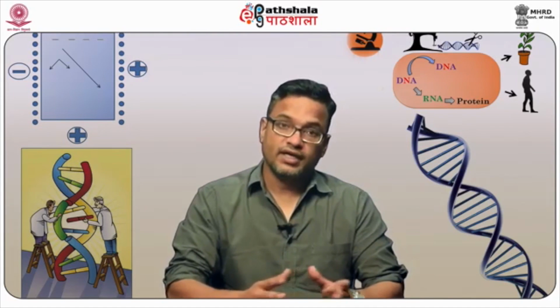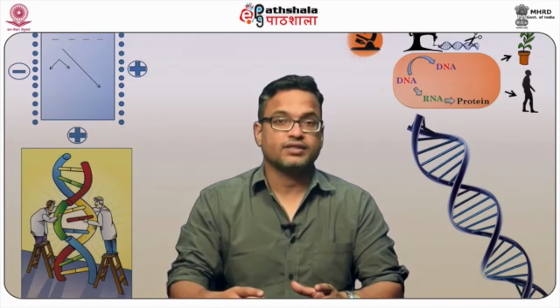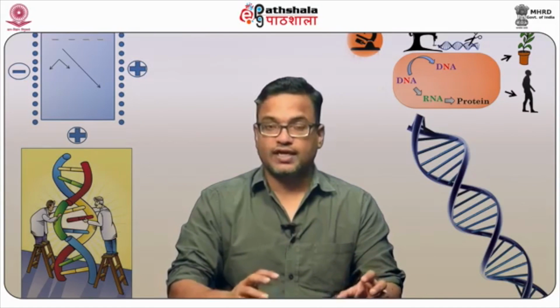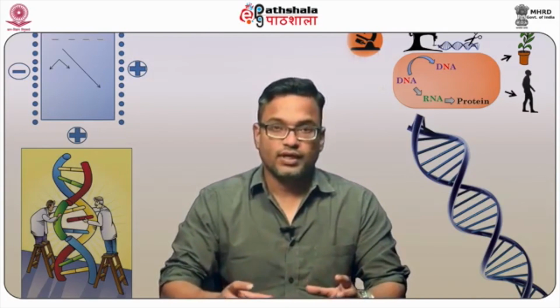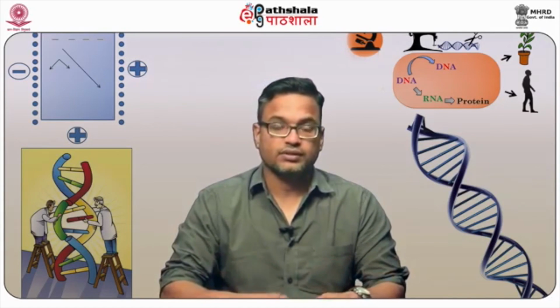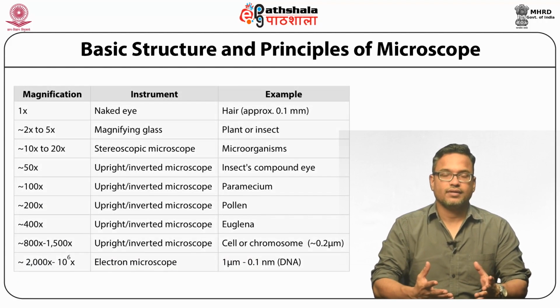As I mentioned earlier, depending upon our applications, we have a range of microscopes available to us, depending upon the sample constitution, the way it is labeled, as well as the complexity involved in a sample. So the microscope can differ depending upon the complexity or the structure of a sample.